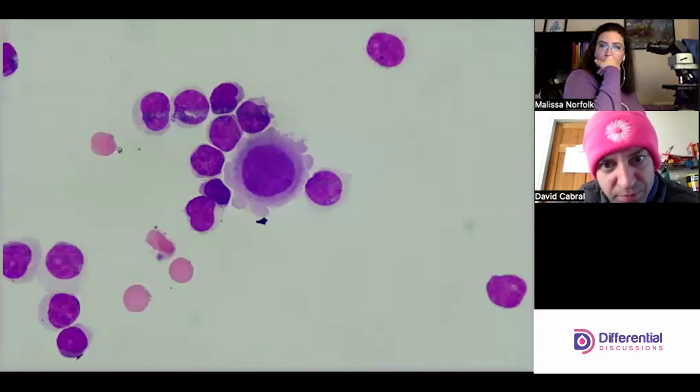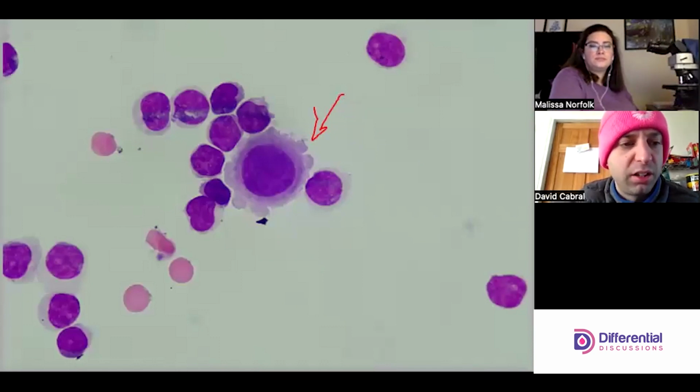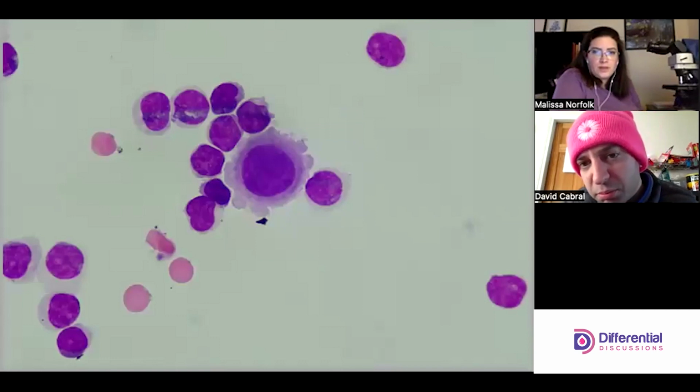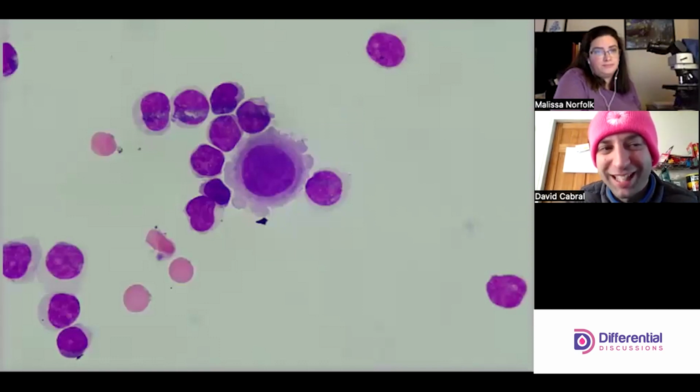So I think for me, talking about cells like this is tough because I've seen the clumps, so I don't like this one in general. I think if it was the first cell I saw, I'd be reluctant to be too scared of it. But it could be a strange meso. Yeah, if this was the only cell you saw, you could consider it. And I think the thing that's giving us a lot of pause is the NC ratio, especially because the nucleus is huge. It's too big. Yep, exactly.